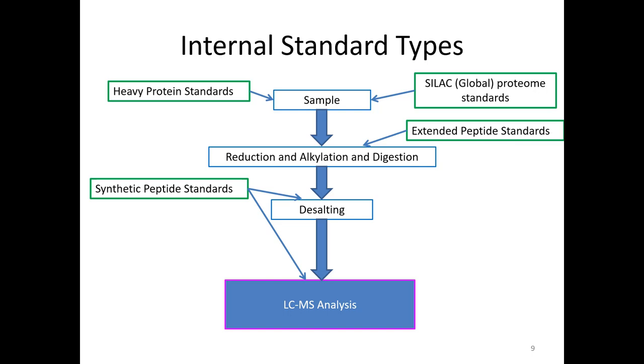If you use heavy amino acids in culture like C13 and N15, and those go into the peptide backbone, and they're digested with trypsin, those have a higher chance for isotopic purity, and so you don't have this weird distribution issue. I actually have slides that can show you a little bit about that, but I can do that later. So that's one problem with those, but obviously they're kind of the best things that we can do to get incorporated high up into the workflow.